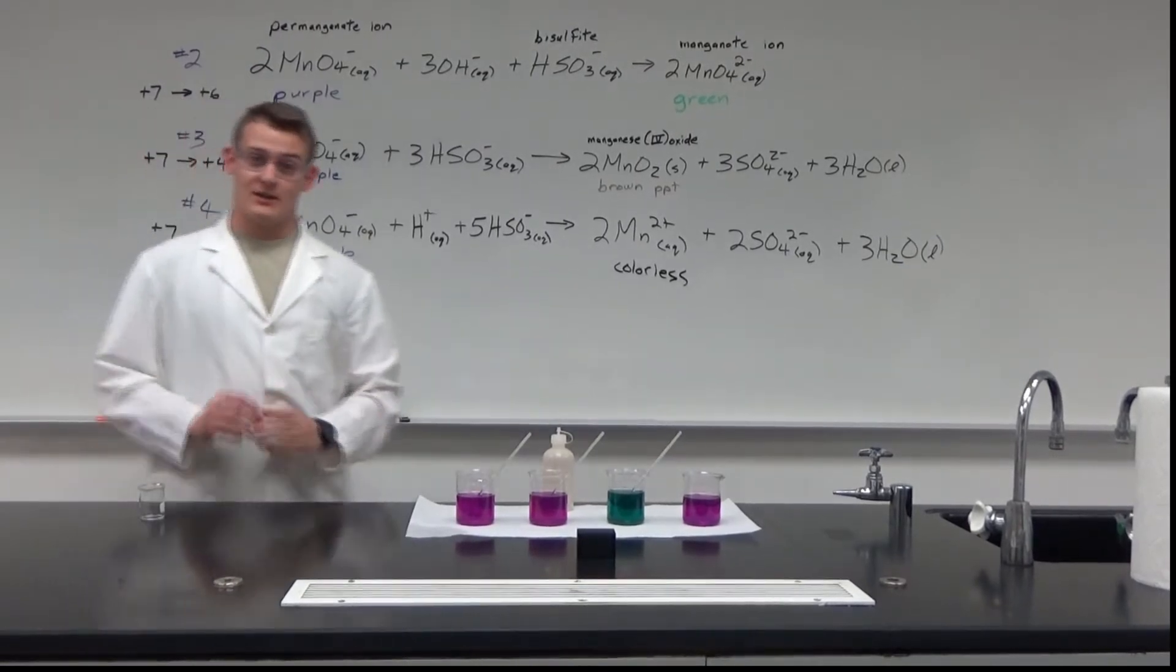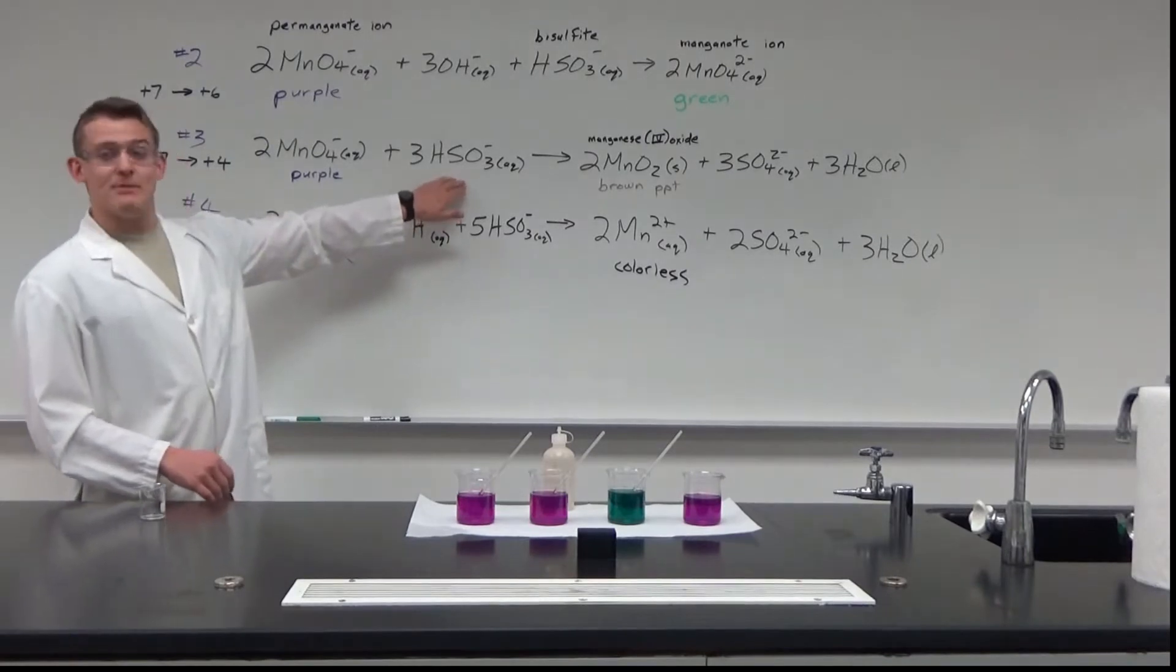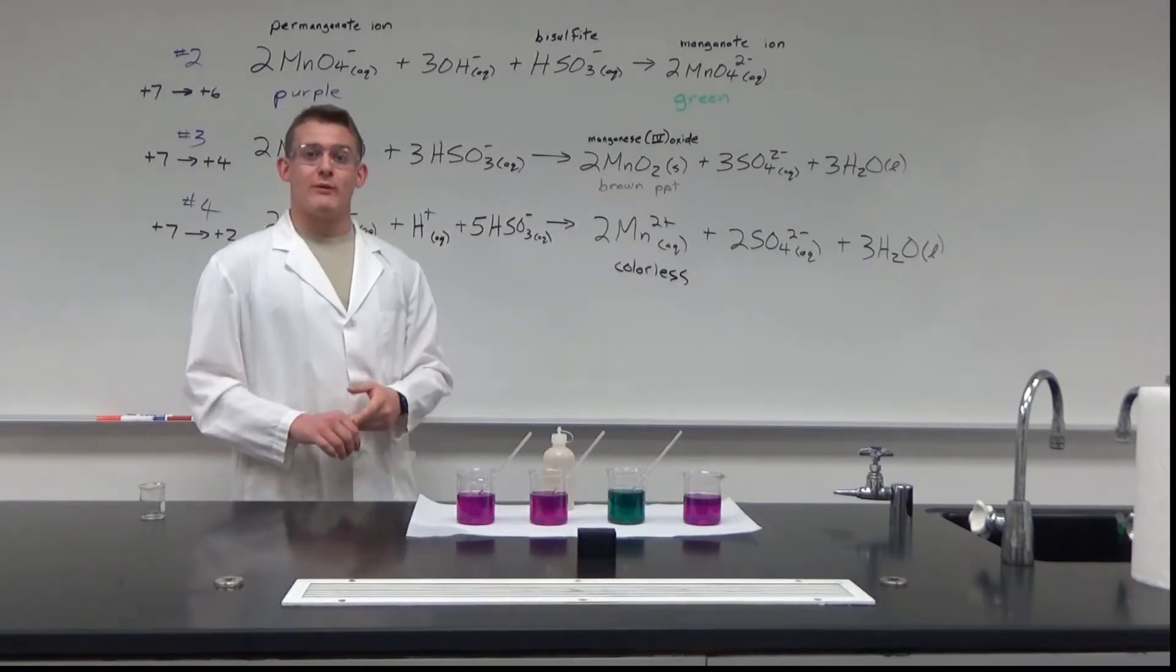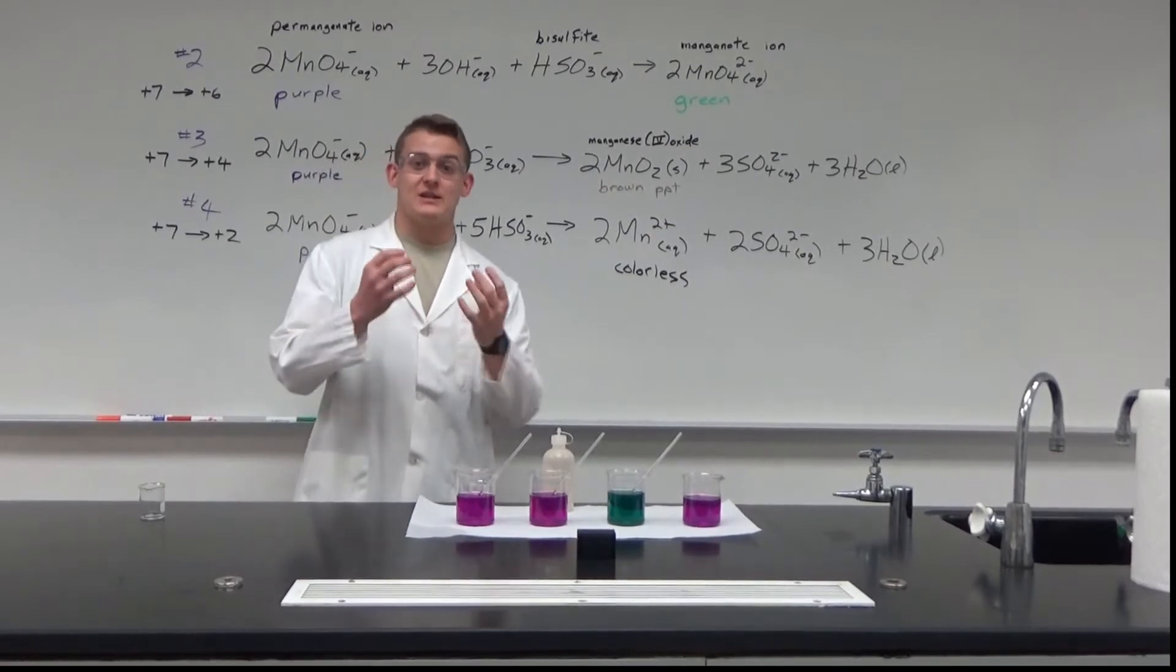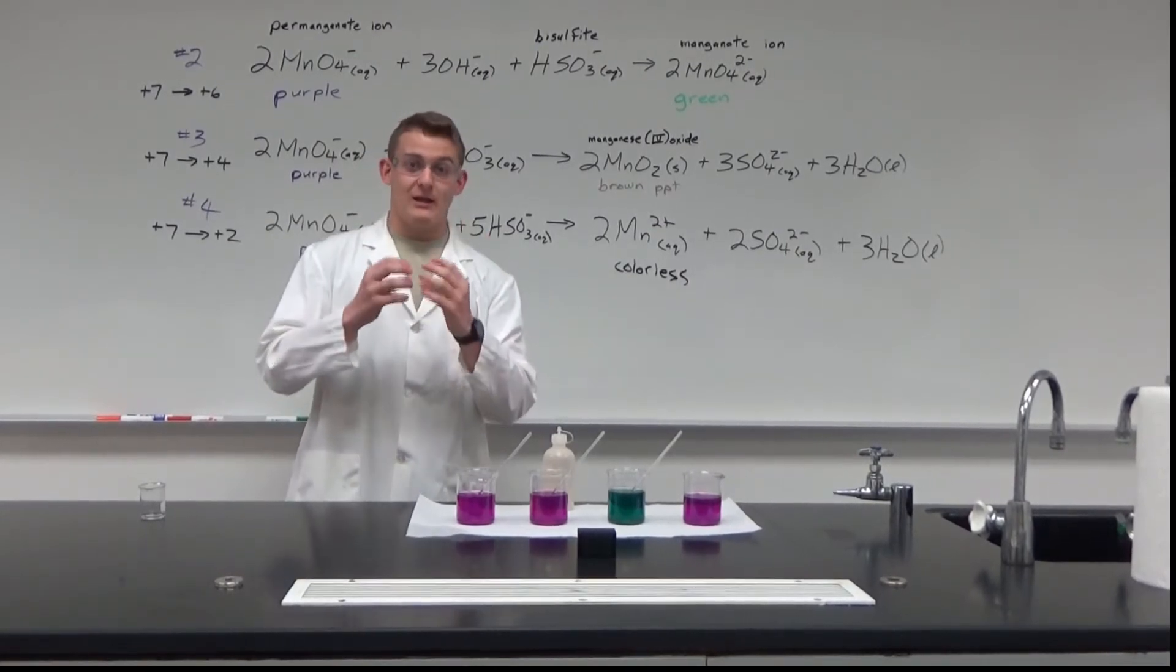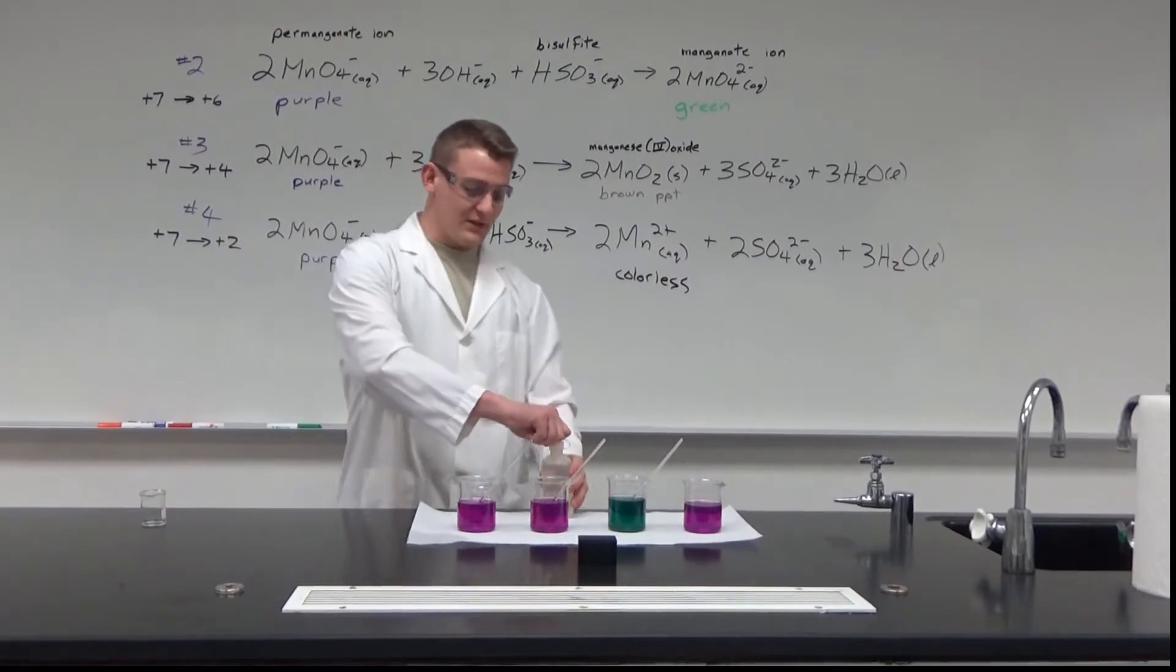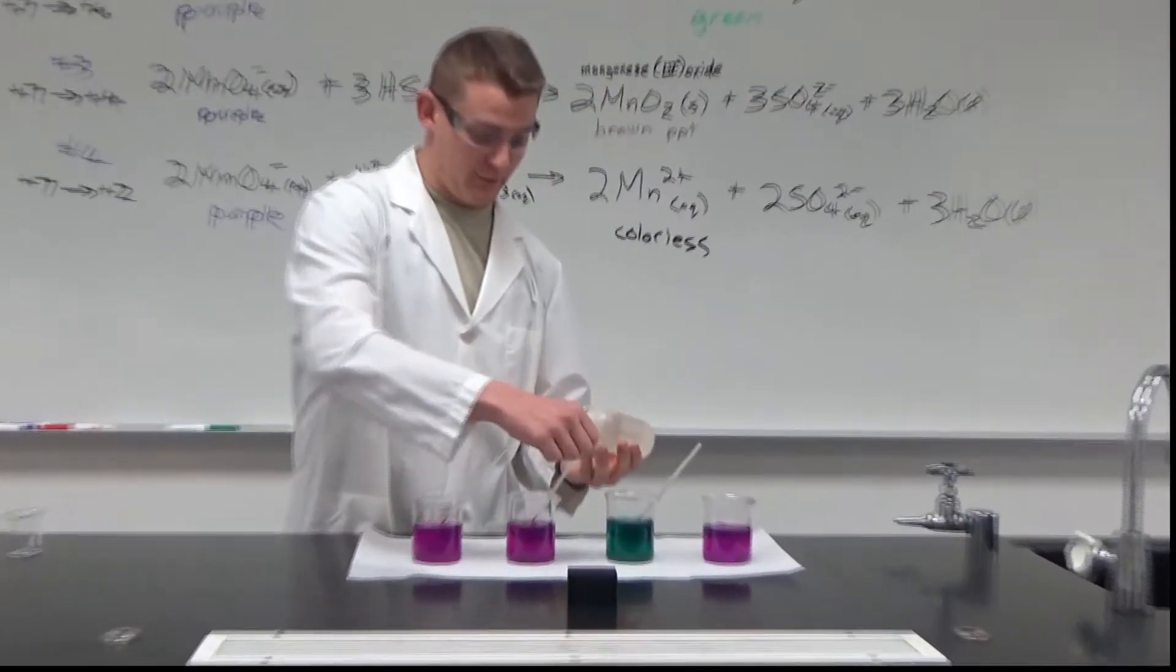The second demonstration we're going to be doing is we're going to just be adding bisulfite to our permanganate ion solution. And what we should end up with is a brown kind of cloudy solution. And what that cloudiness is, that's a precipitate forming. And that precipitate is what's making it cloudy, but over time that should settle at the bottom of the beaker, and the solution should be a little bit clearer. So I'll go ahead and demonstrate that for you.